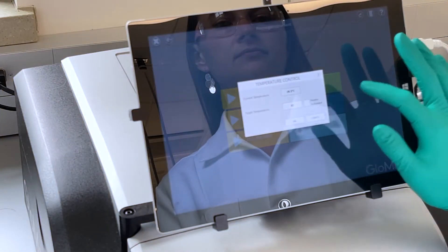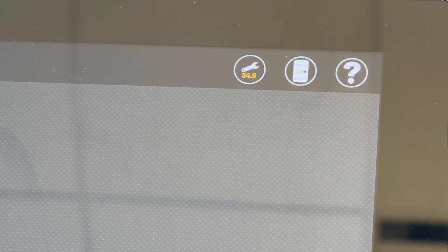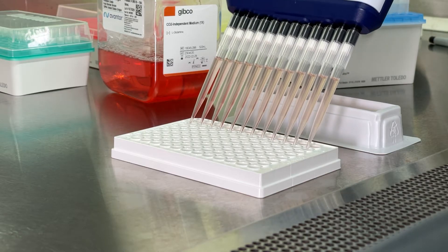First, I pre-warm the instrument to the desired temperature. Then, I set up my assay plate with cells and reagent.